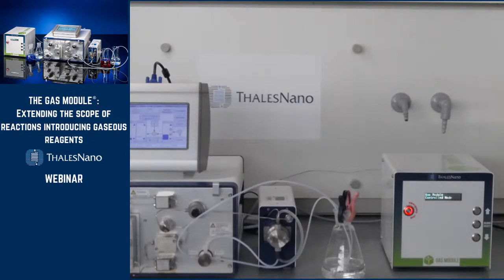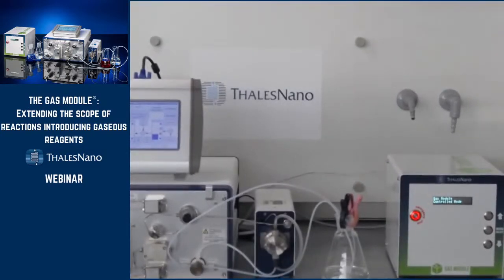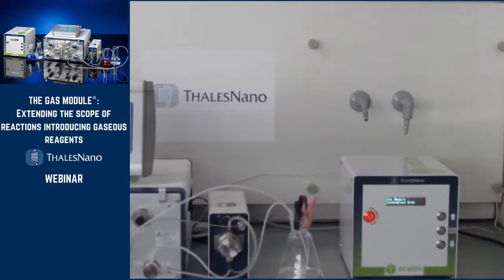So there are two modes in this gas module. First, there's a standalone mode in which you can provide a flow rate to any flow setup, I would say. Not especially the H-Cube Pro, but any other flow setup you would have made. So for this, you would control the different parameters. You would select the gas, you would set the pressure, and you would set the flow rate directly with those three buttons to select the values and the parameters.